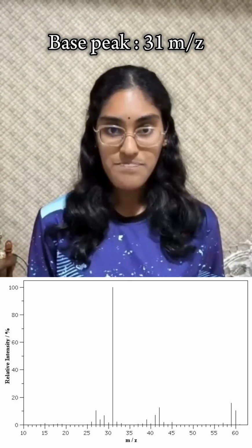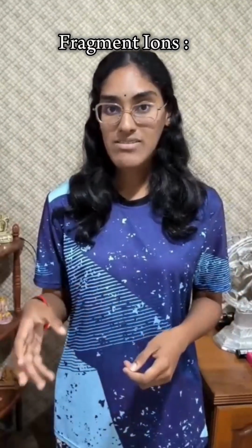We can see a base peak at 100% intensity at the m/z of 31, and a molecular ion peak at the m/z of 60. From this we can know that the molecular weight of the unknown compound is 60 g/mol. There are also other fragment ions present at m/z of 27, 29, 41, 42, 39 and 59.